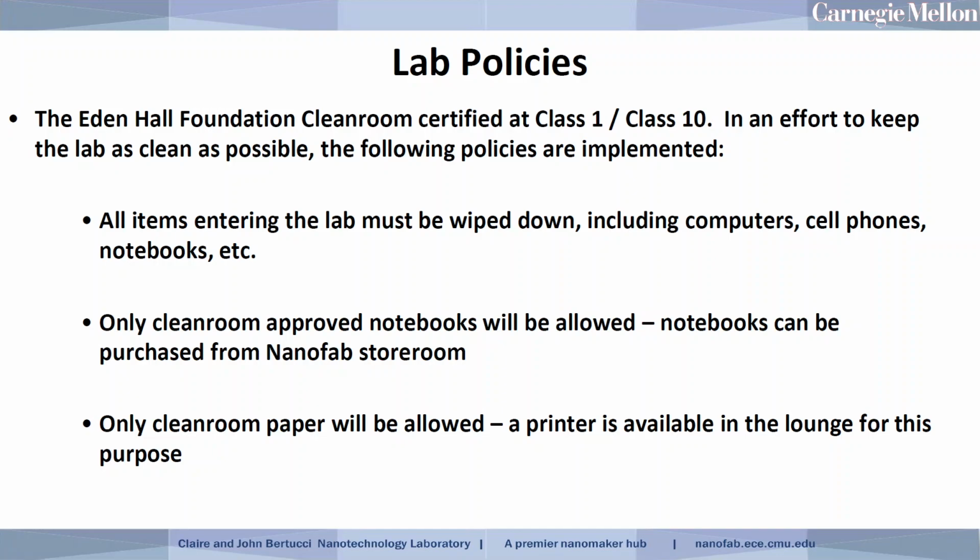When we first certified the lab, so after the lab was built, but before we really started moving tools in, we had a test done to monitor the particles inside the clean room. So it certified at class 1 and class 10, whereas it was spec'd to be class 10 and class 100.